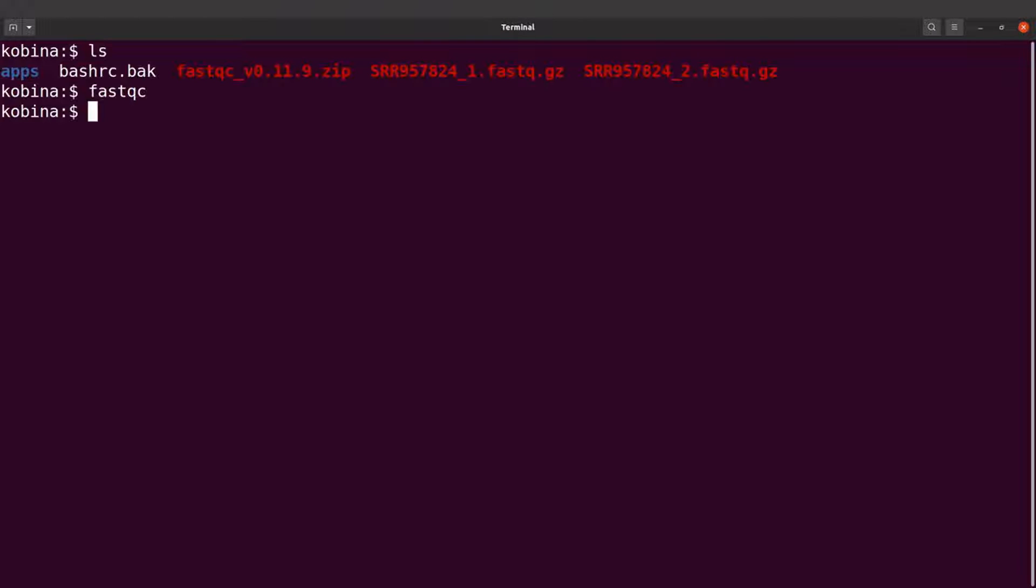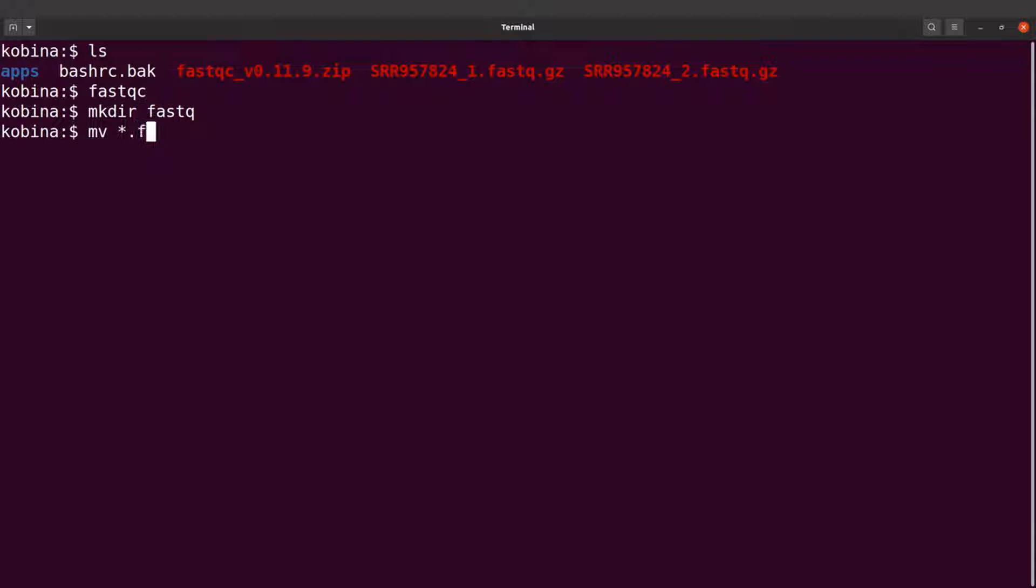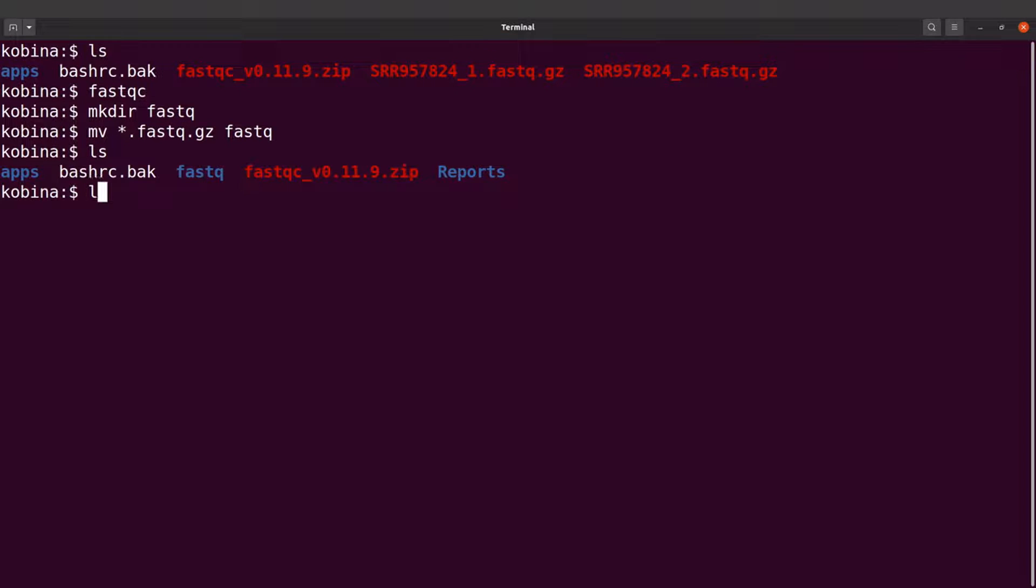If you're on the command line, let's look at these files here. I'll just create a directory and move them there: mkdir fastqc. I'll move them with mv star dot fastq dot gz into fastqc. I'll do an ls and then ls into fastqc.